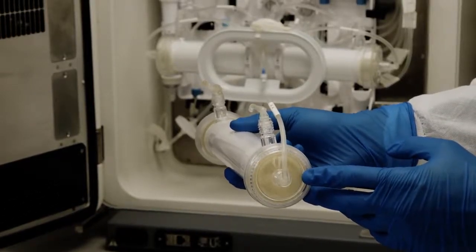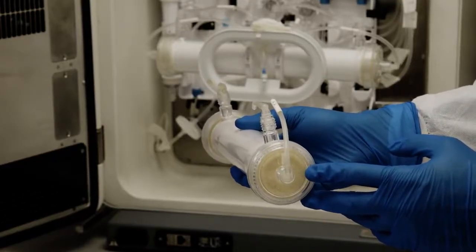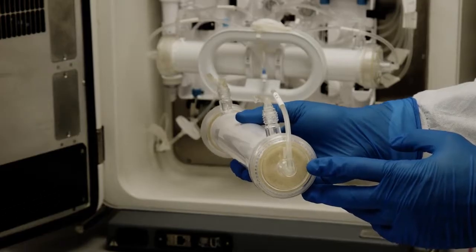For adherent cells, this is going to provide a 21,000 centimeter squared surface area, equivalent to 120 of your T175 flasks.